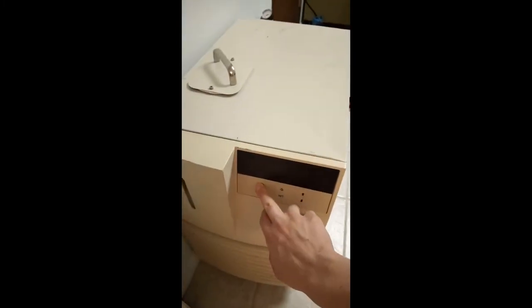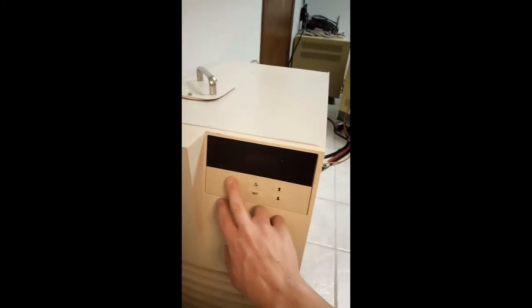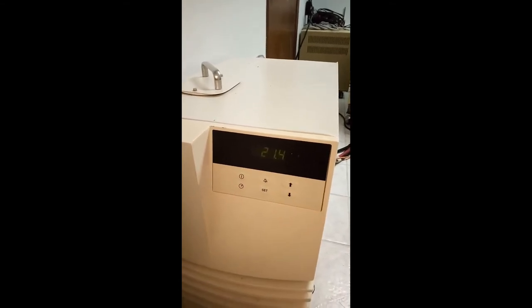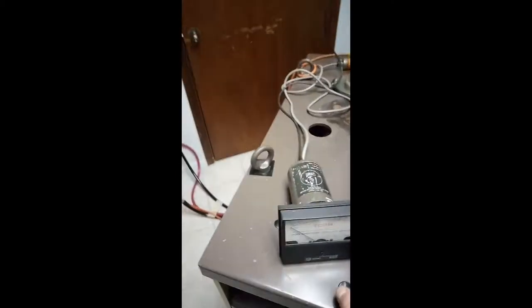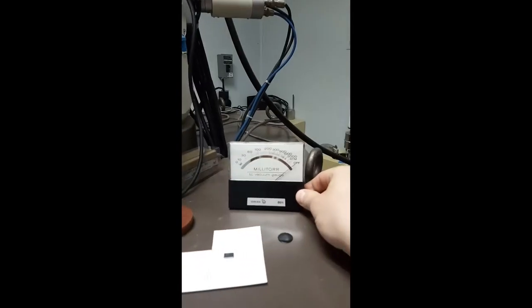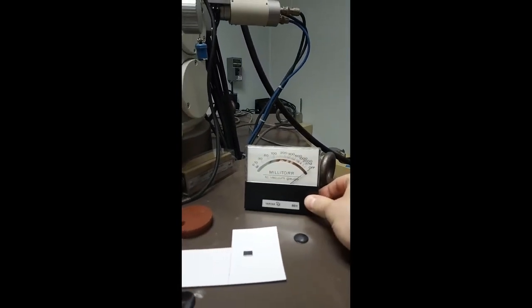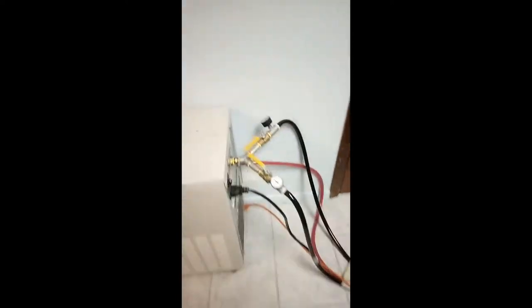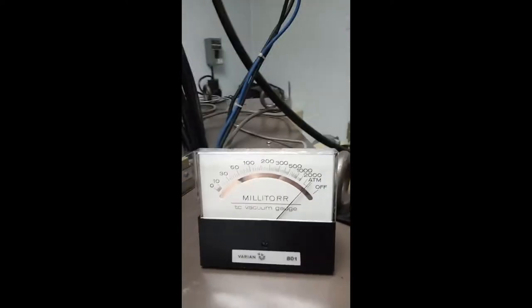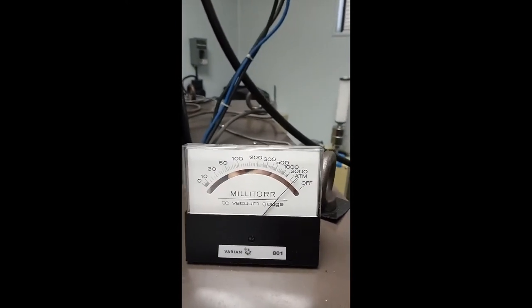We turn on the water recirculator. It's already set at the right temperature. The high vacuum gauge and the low vacuum gauge are on their own power. So we need to plug that one in. You can see the needle has moved to atmospheric pressure.